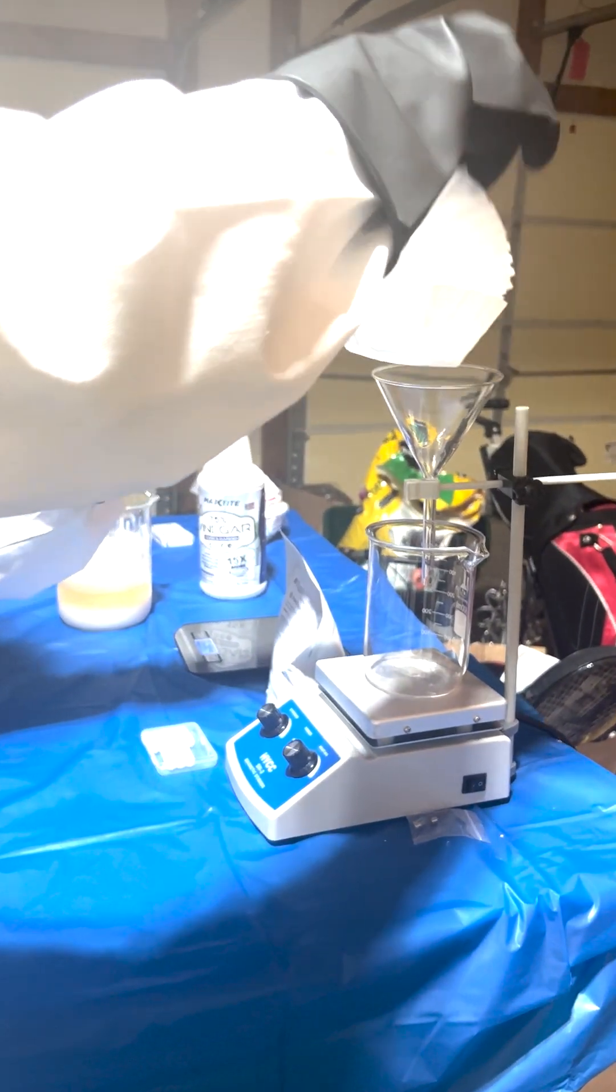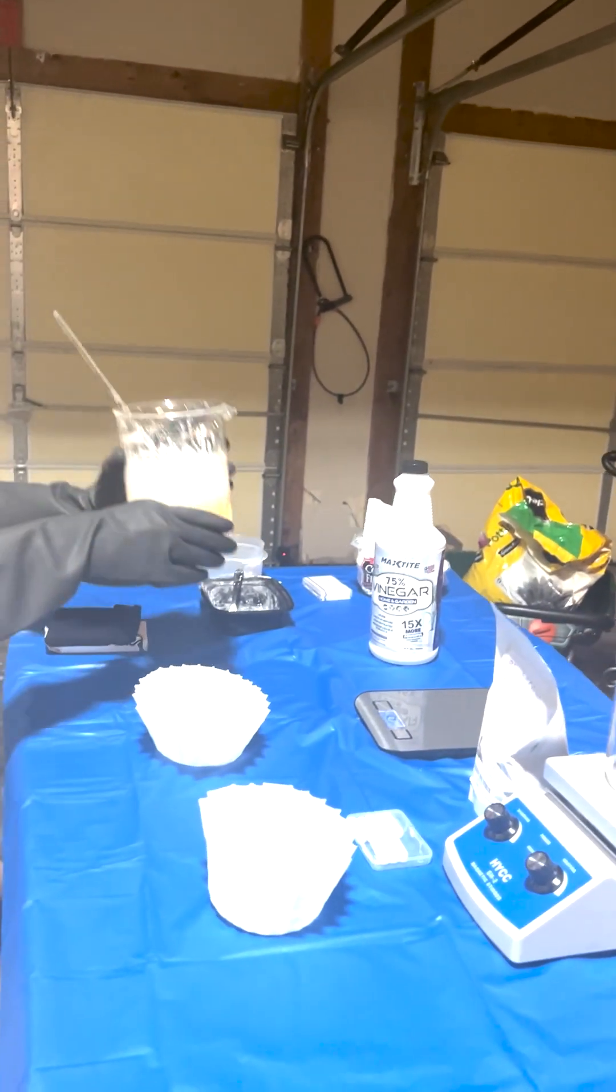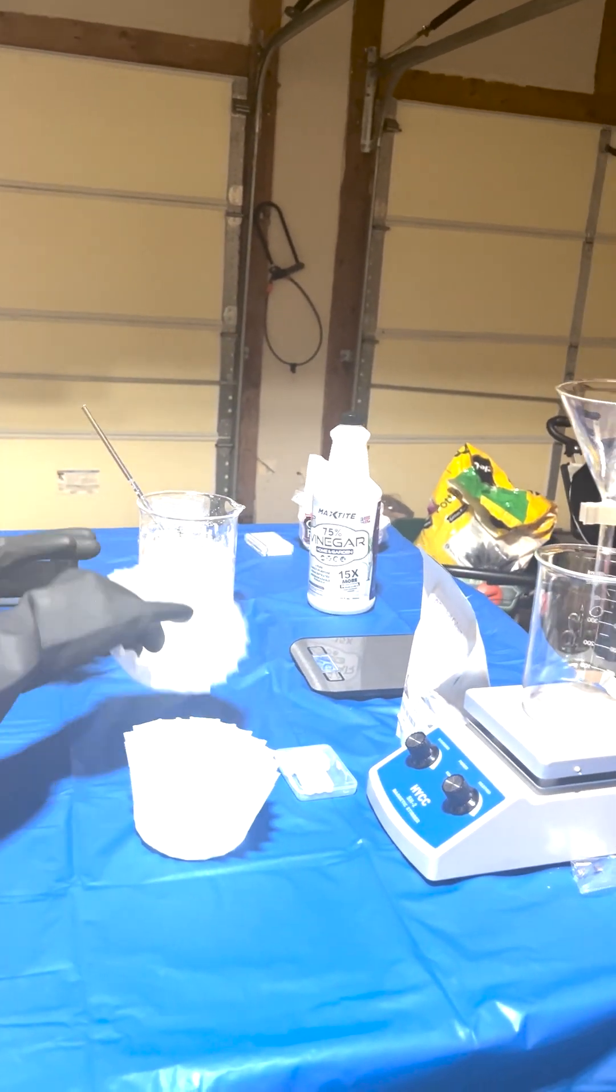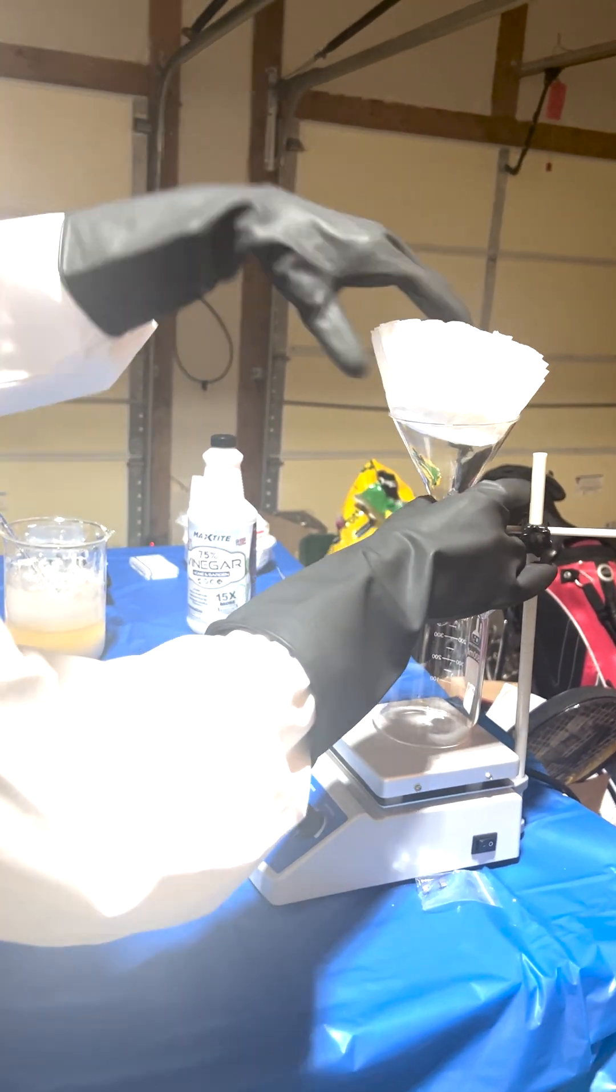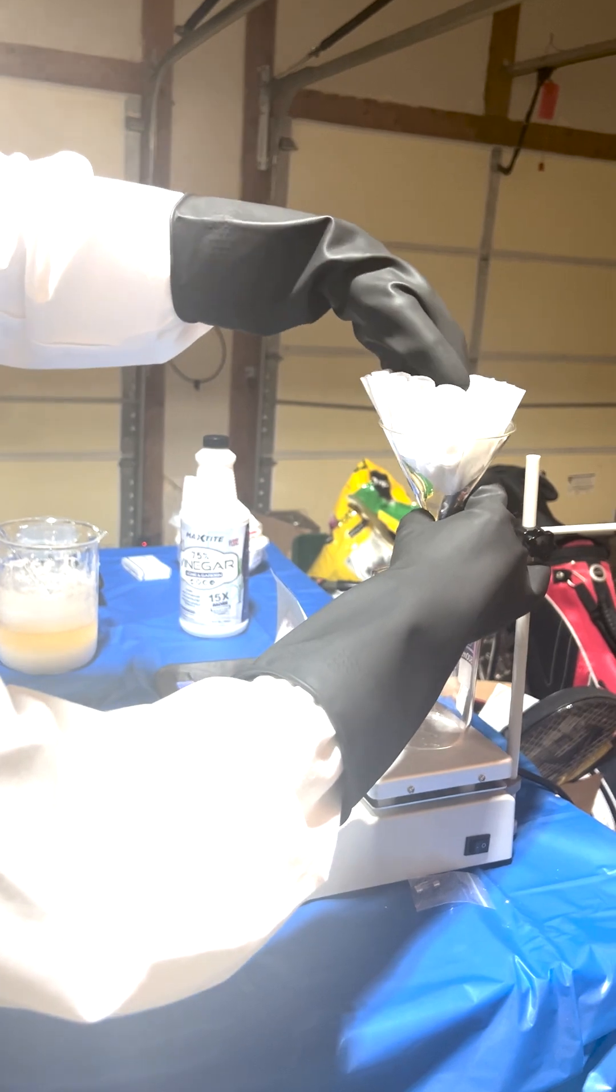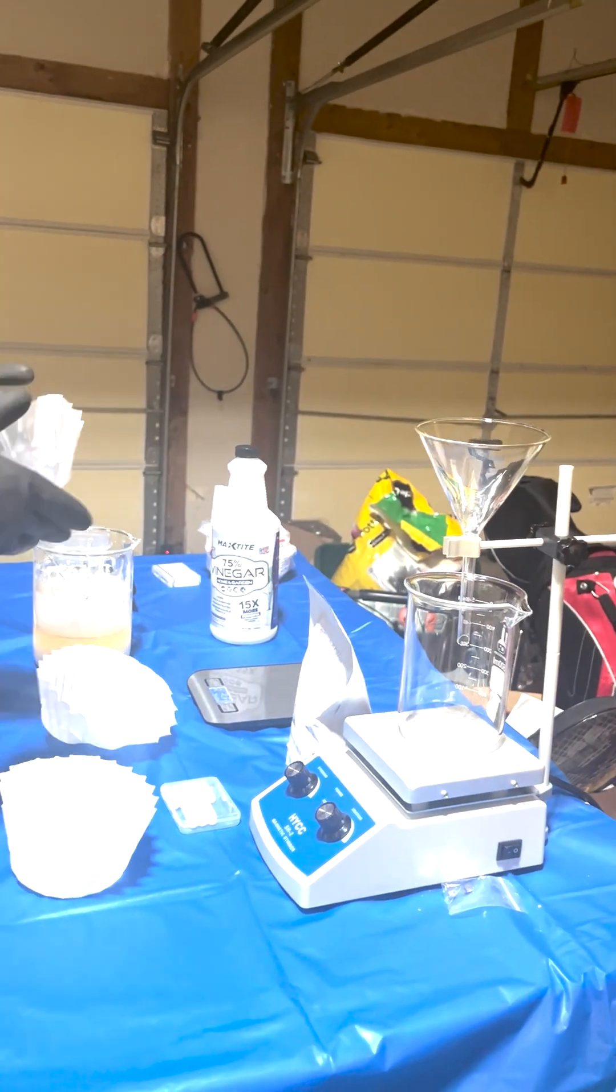Right now, all we're doing is filtering only the aqueous part of this solution out, and then we'll get rid of the remaining eggshell powder, because theoretically, all of the reactions should have occurred by now, and all we have to do now is extract our calcium acetate from it.